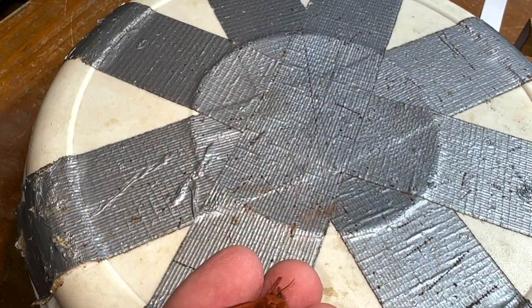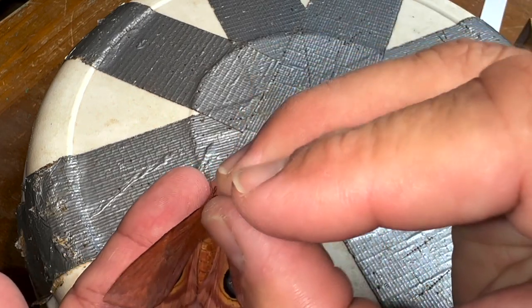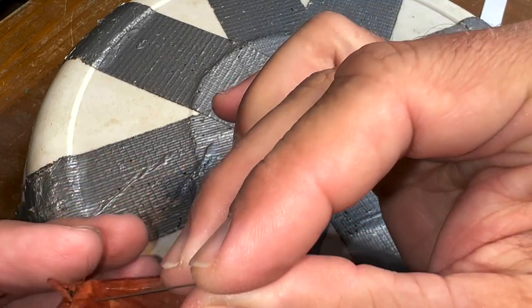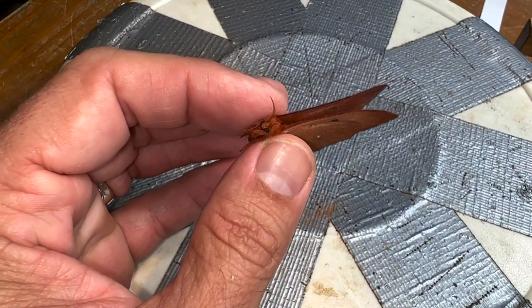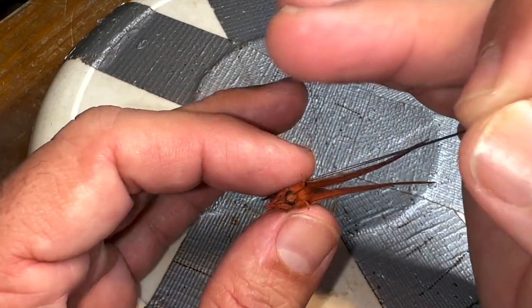Look at this beauty — check this girl out. I actually only have a couple of females from the Florida Keys in my collection. The males a lot more readily come to light. I'm using a number two black enamel pin.